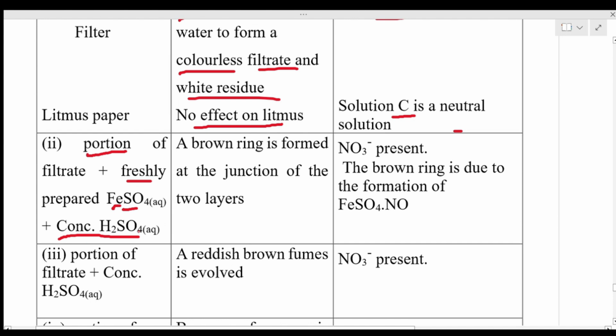the students to add H2SO4. Don't leave them to add H2SO4, because students are students, okay? They will only play with it. And when they play with it, it's hazardous, it's dangerous to their body and to their health. Please help them to add it in case the WAEC asks the question.